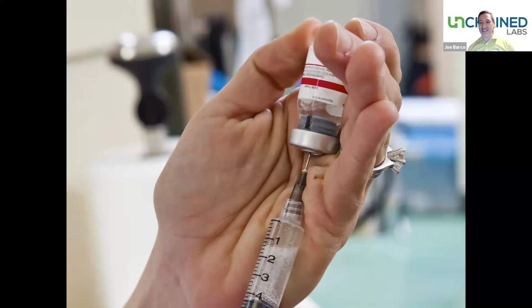The third thing is that it's pulling in air and bubbles and who knows what particulates, because of the fourth thing, which, from this image, looks like he's somehow aspirating through the crimp cap. So I don't know what this drug is. I just know I don't want it anywhere near me. But this highlights the importance of technique for something that we all take for granted when we go to the doctor.